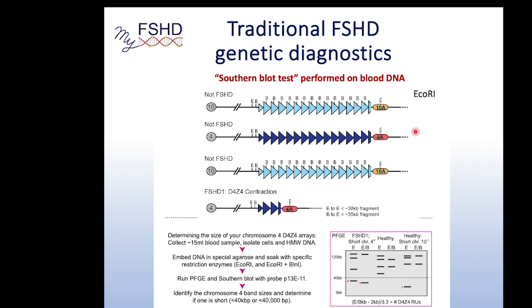Well, the way you're going to do it is cut with your restriction enzymes, and then you're going to separate the DNA fragments by electrophoresis. DNA is negatively charged, so it's going to run towards the positive, and you run it through an agarose gel. Agarose is isolated from kelp, actually. I guess you can even eat it. It's kind of like gel. Based on the percentage that you run, you're going to separate the DNA fragments based on size. The smaller ones move through the gel much faster, and the big ones get held up. So you end up separating all the DNA based on size. You're also going to run a marker that tells you exactly the size.